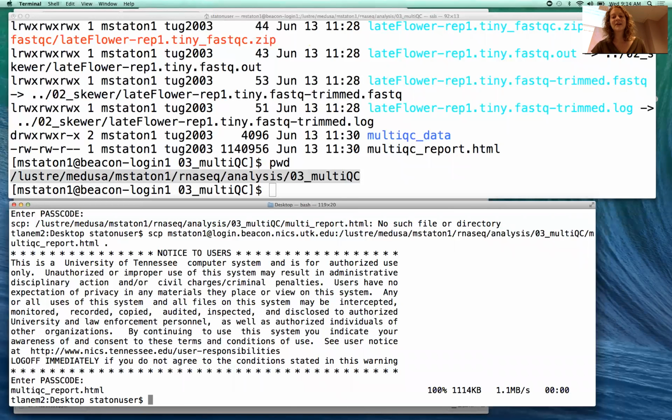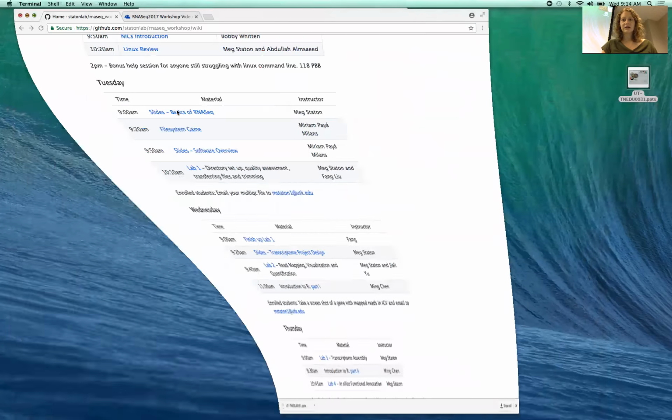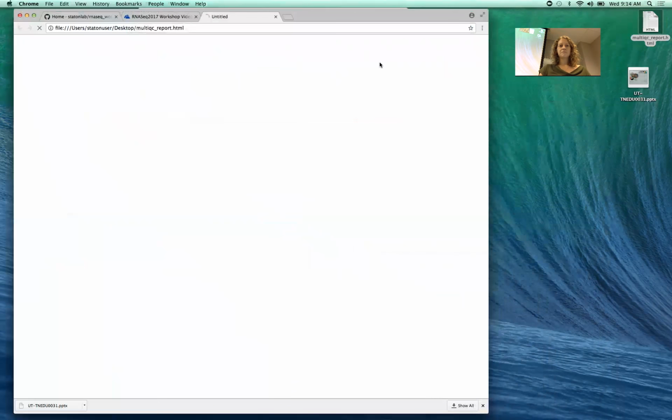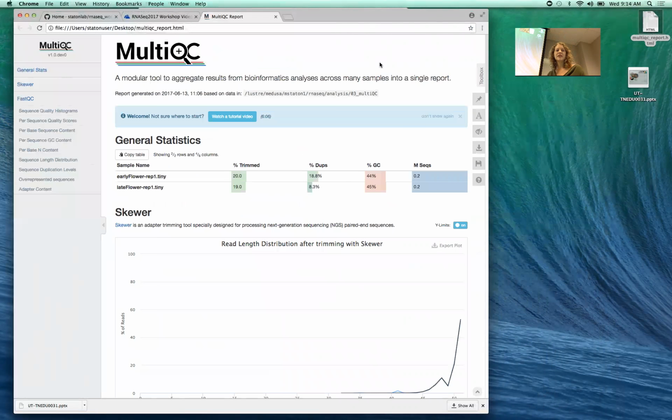All right, I don't see any red stickies, so we're gonna move around. So this is great, this is on our desktop. And that means we can just double click on it and open it. Hopefully, if I can find where it went. There it goes. So it has created this lovely HTML output so that we can look at our files and see what's going on. Up here, you'll see this handy watch a tutorial video.